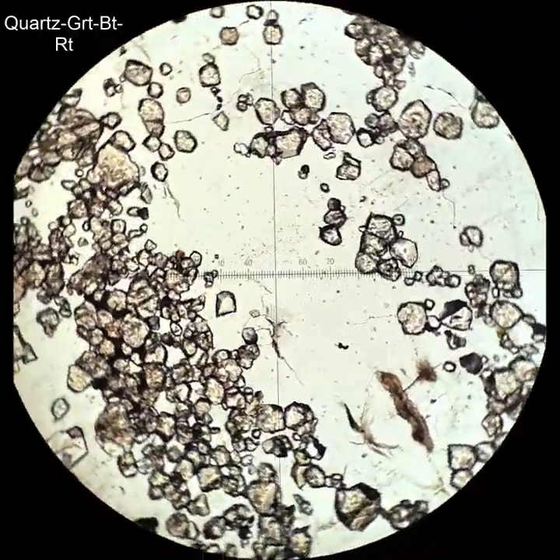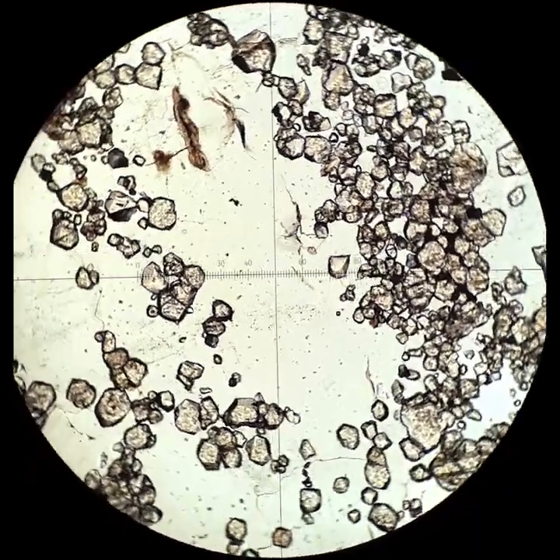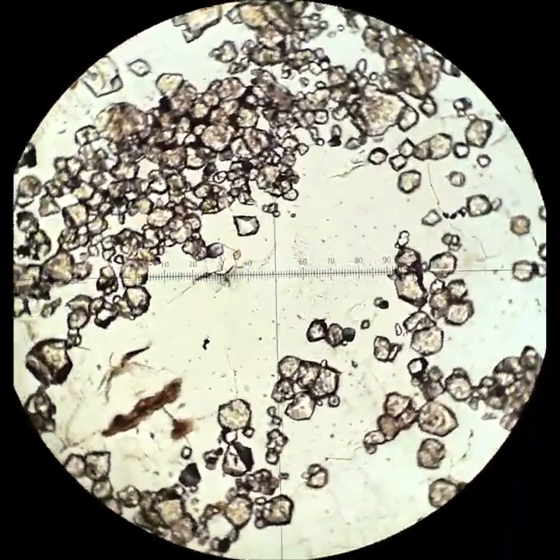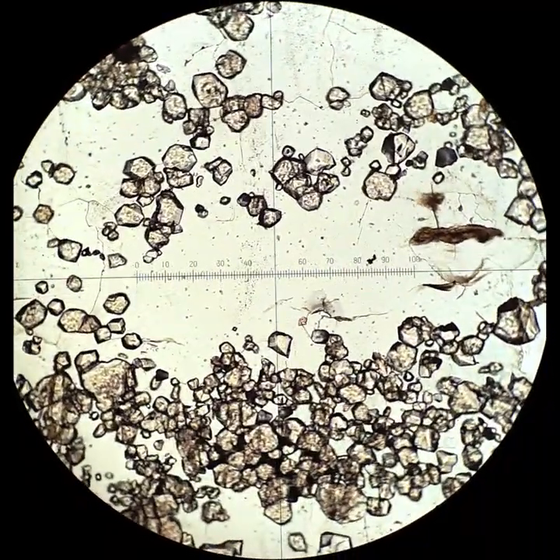This is another garnet quartzite, and what you'll see as the polars are crossed is that it has started to break up into different subgrains. This is really typical texture for quartz, that it'll develop these different domains that are almost the same orientation, but not quite the same. And so it almost all goes extinct at the same time, but you can see some variations from one side of the grain to the next.